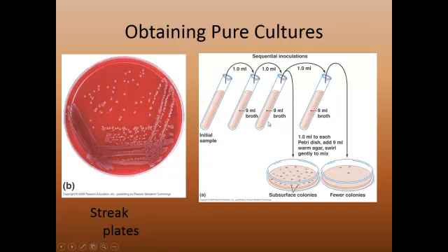So you can see here we have 10 times as many colonies as we do here. We would call these spread plates. Now this figure is actually an example of a series of pour plates. That's where we take the broth, mix it into the agar while it's still liquid, but cool enough that you don't fry your poor little guys, and then you pour it into the agar plates. See, we have subsurface colonies growing inside the agar. With spread plates, of course, you would only have them growing on the surface.